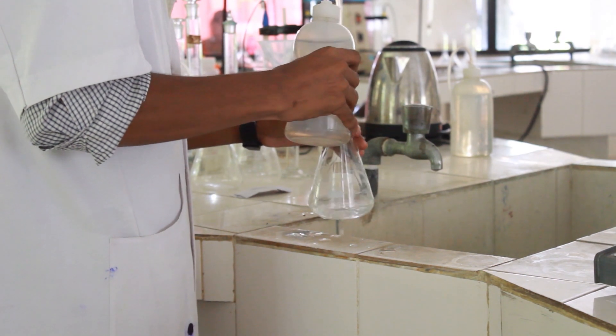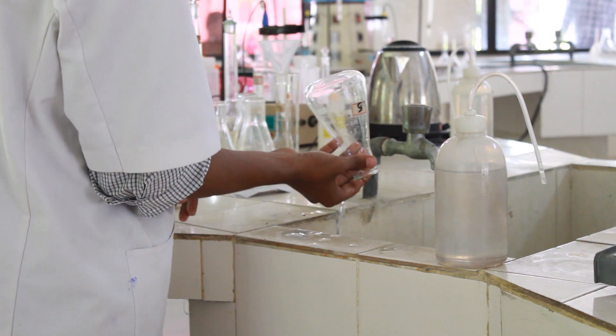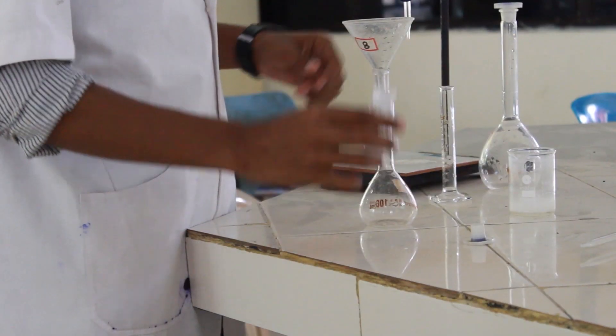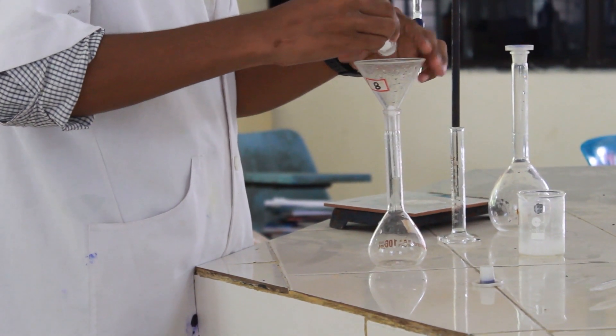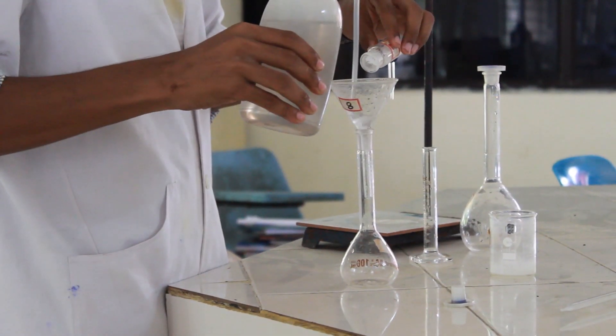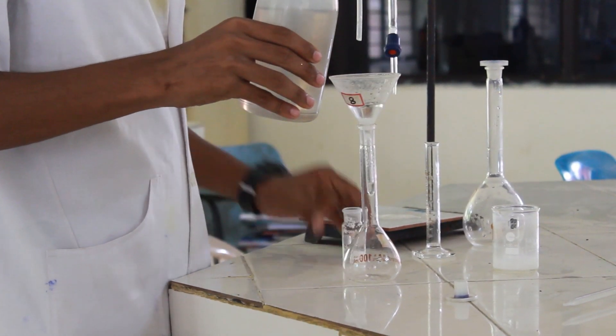As a regular procedure, we have to clean all the glassware before starting our experiment. Now it is time to prepare oxalic acid solution. As oxalic acid is a primary standard solution, it is used to standardize sodium hydroxide solution.